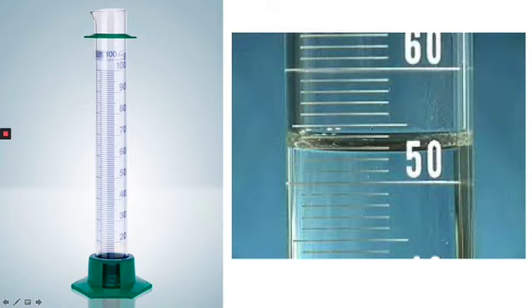In both cylinders, you can see we have these large numbers sitting on these big lines. Those are called our graduates. Those are our known volumes. If the meniscus measuring is sitting on one of those lines, we know what the volume is. In between, we have unmarked lines. These are the subgraduates. And the question is, what is the value of each of these little smaller lines?